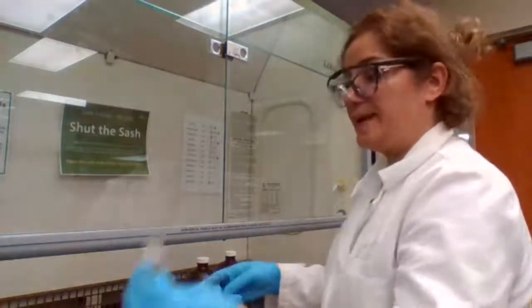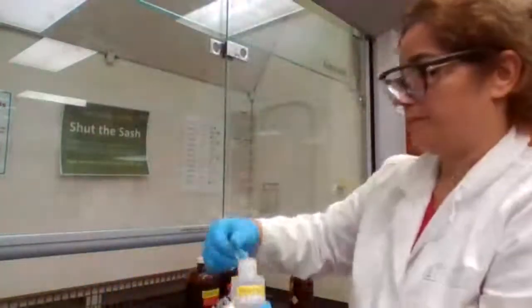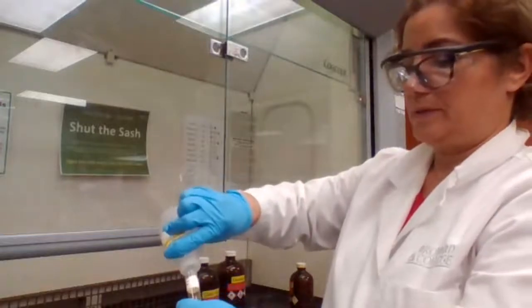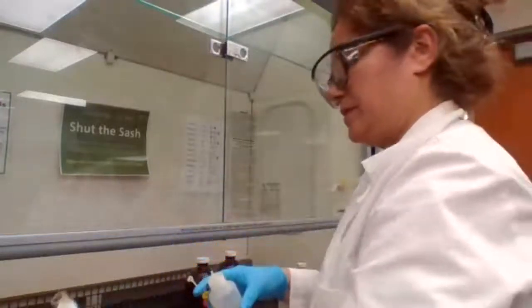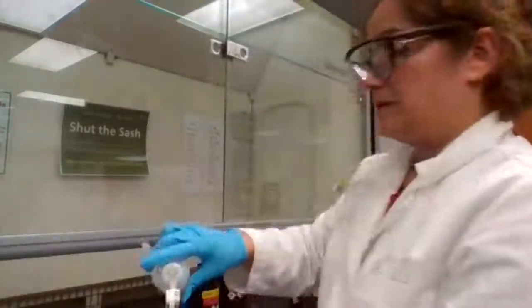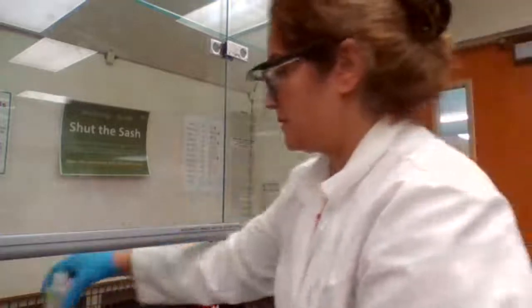Okay, this was the contaminated solution, I think. I'm going to have to repeat it for B because my dropper was contaminated. I want to make sure that is the right result.